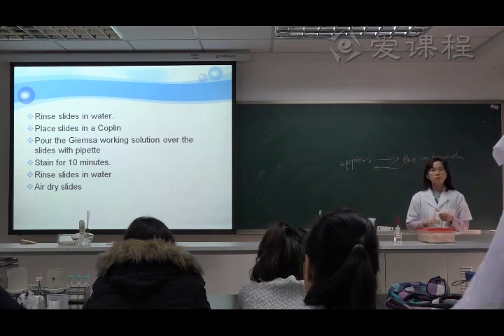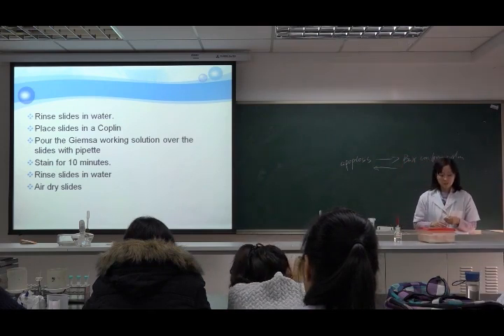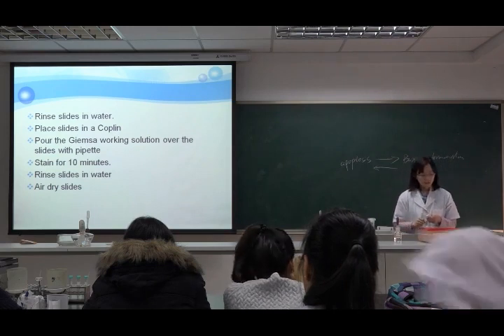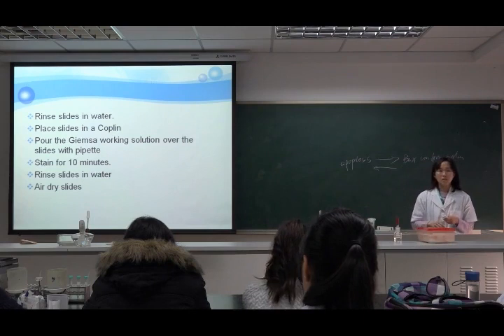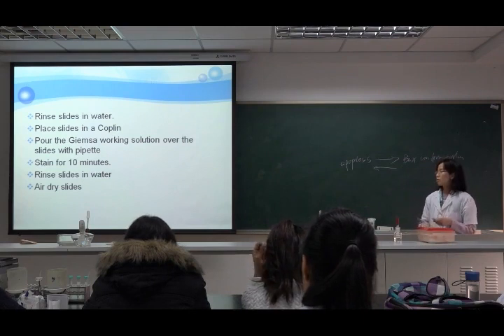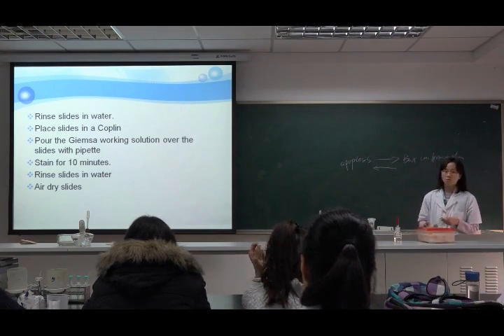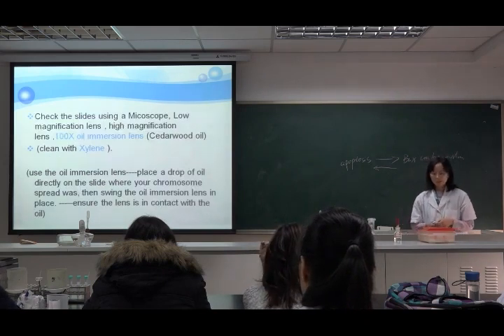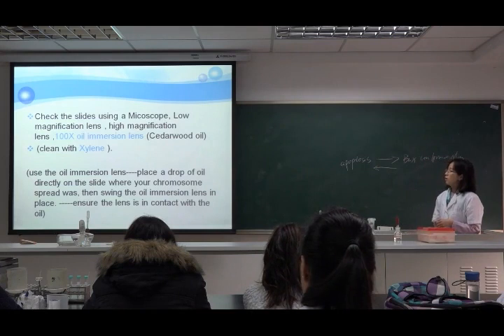After that, we stain for 10 minutes. After 10 minutes, we rinse the slides in water again. Then you air dry the slides. That means do not leave so much water on the slides, just air dry them. Then we can check the slides using a microscope.